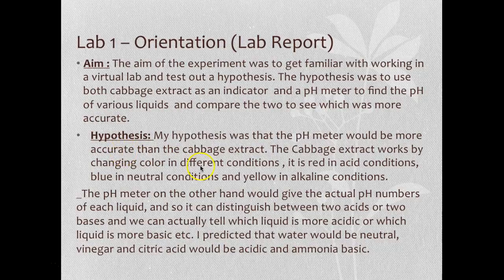So my hypothesis is that the pH meter would be more accurate than the cabbage extract in making a distinguishing factor between acid strength and base strength. It would actually be able to show me which is more acidic or which is more basic, and this is because the pH meter gives me actual pH numbers. So my prediction is that water would be neutral, the acids would be acidic, and ammonia would be basic.